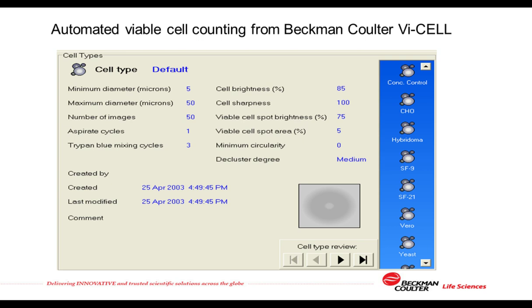The USP Chapter 1046 indicates that automated cell counting and viability instruments can provide a higher degree of precision and a more reproducible enumeration. These improvements are optimal if the cell preparation stage is automated as well, thus reducing the opportunity for technician errors. Additionally, if the automated cell counter can use electronic pre-programmed cell counting standard operating procedure libraries that match the manual SOPs for cell counting designed by the user, then results are more likely to be accurate and reproducible.